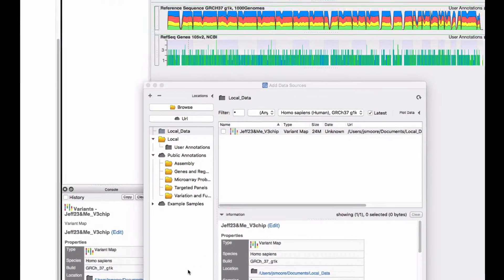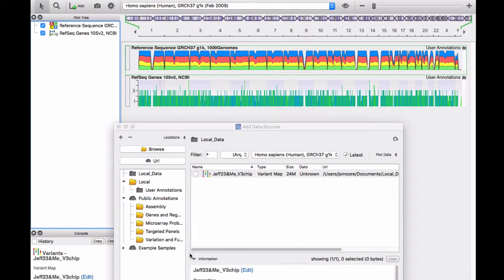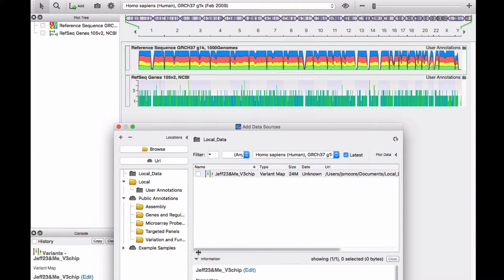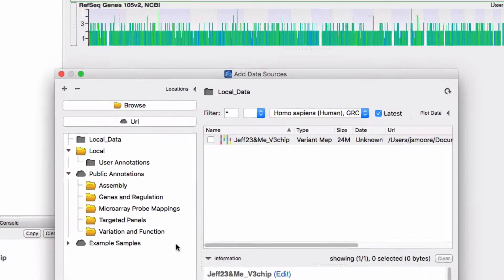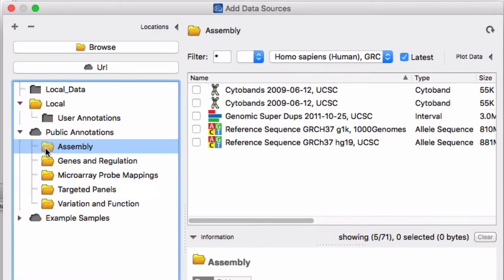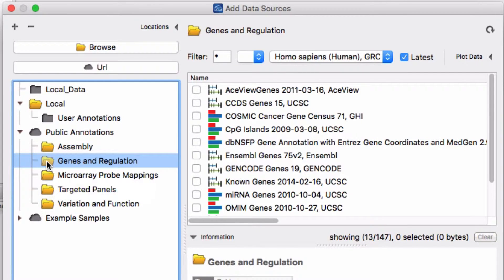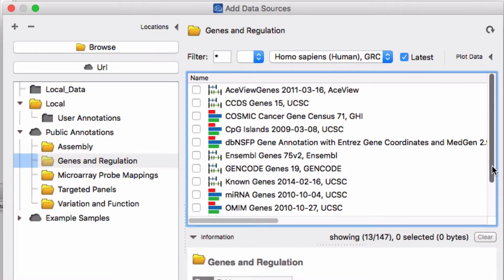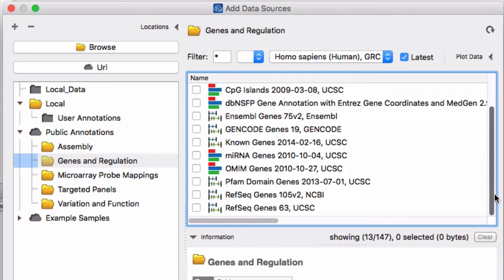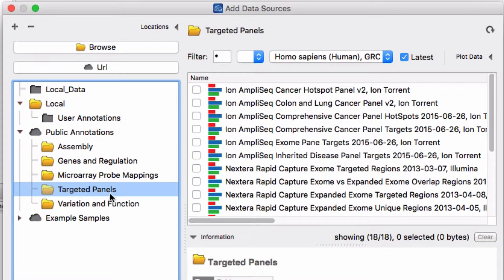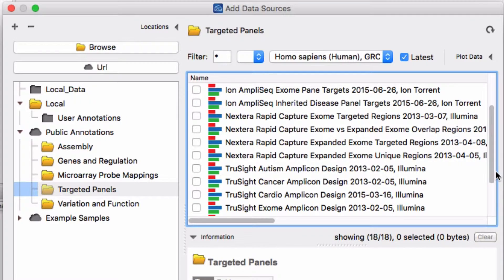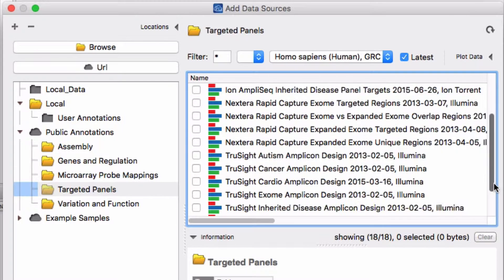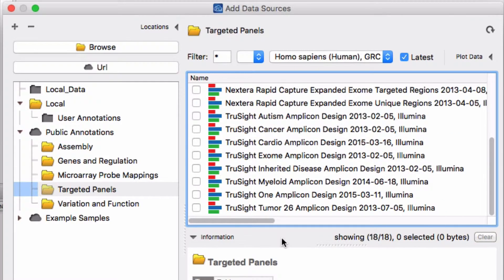Back in the add data sources window, locate a cloud source of DBSNP for downloading. Cloud files are stored in public annotations. There are several annotation types. We'll find DBSNP in the variation and function folder.